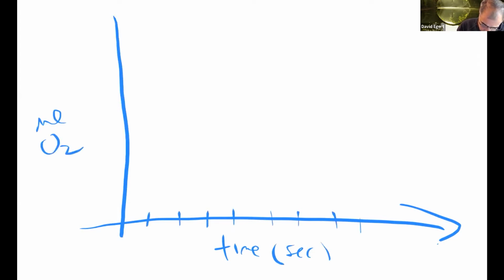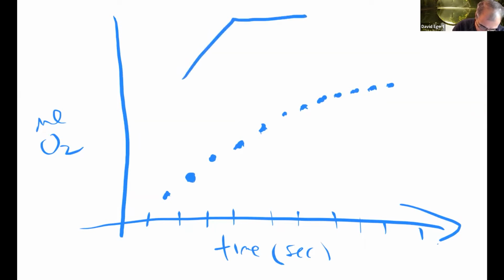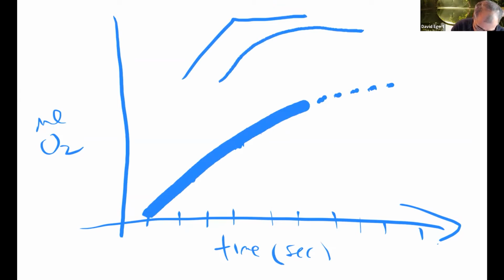The reaction is going to be going at its best in the beginning, probably the first 30 seconds. It doesn't go up and then die. It goes up and slowly dies and slowly dies and slowly dies. It's more like that. So when we see one of these things, it's kind of like that.